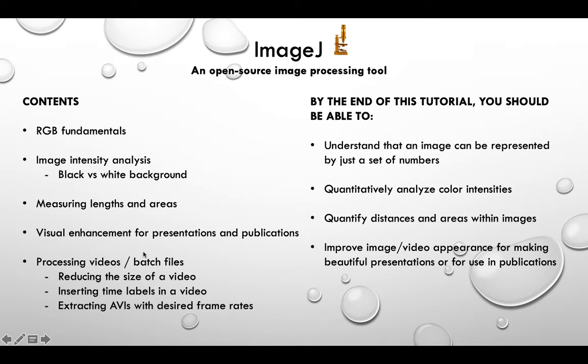When you're doing microscopy, especially mammalian cell cultures, or rather long-term imaging over days, you will often take a picture of something every hour. And so that is stored by the computer as file name underscore 01.jpg, and the next is file name underscore 02.jpg. So it's always saved in a sequence of names, and ImageJ has a way by which you can simply tell it the base, which is file name, and it will automatically open all the files which have 01, 02, 03, and so on.